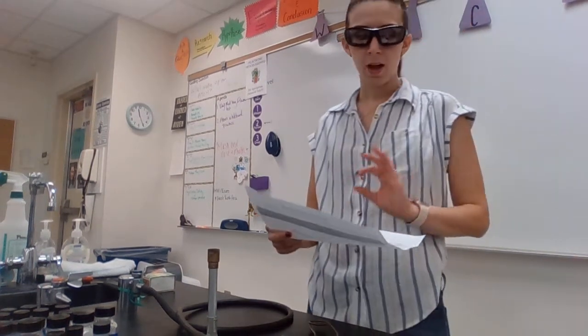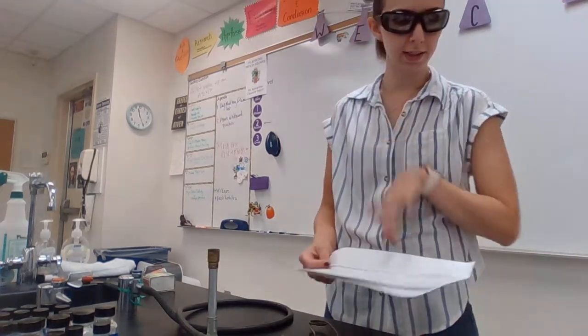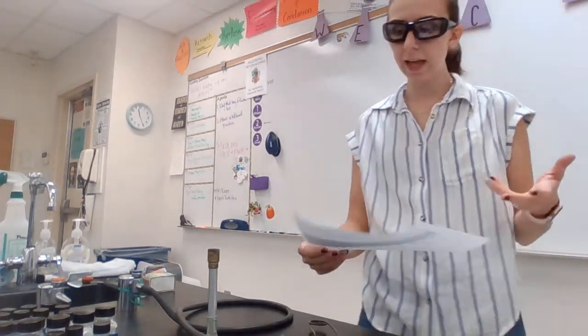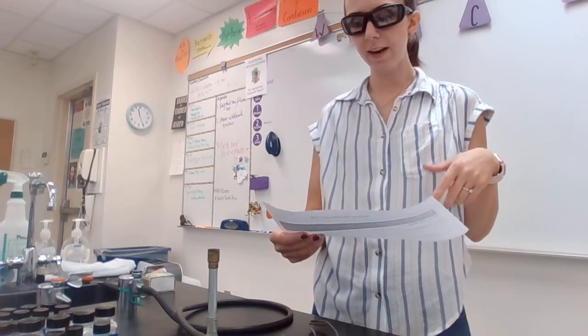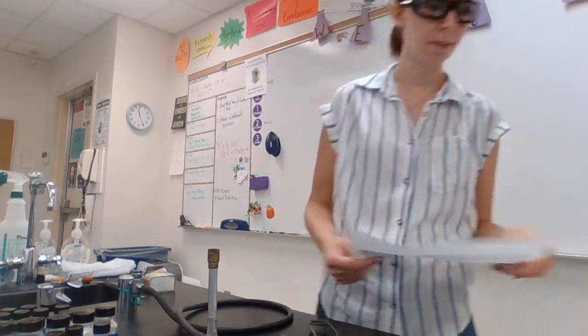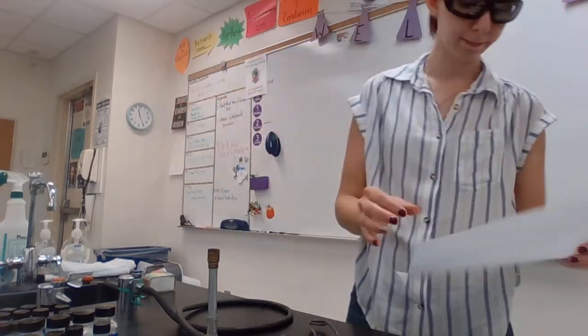Good morning, everybody. Today I'm going to show you guys the flame test, like a virtual version, just so you guys can see what's going on if you are not here. So what we're going to be filling out is a claim evidence reasoning. Are there any elements in the medicine bottles that could have caused poisoning symptoms like Hall's? Can you identify a specific medicine that could have been used to poison Captain Hall? That is our question. This is what we'll be filling out online as a Google Doc.